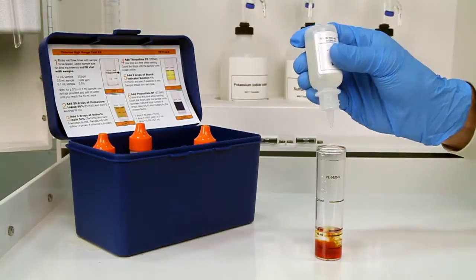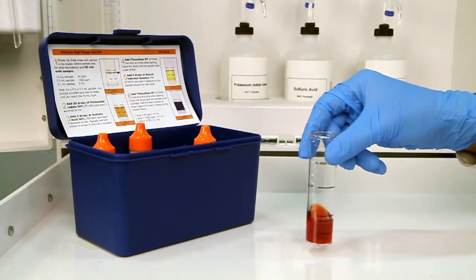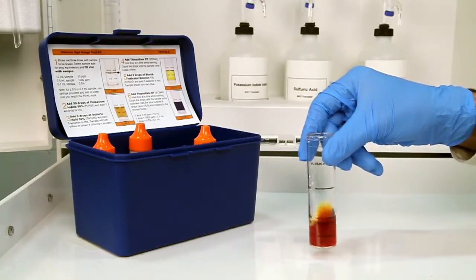After the addition of each reagent, swirl the vial five seconds to make sure the reagents are properly mixed. The sample will turn yellow or brown if chlorine is present.